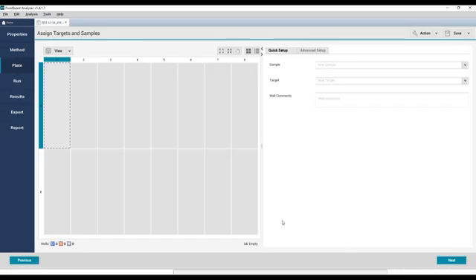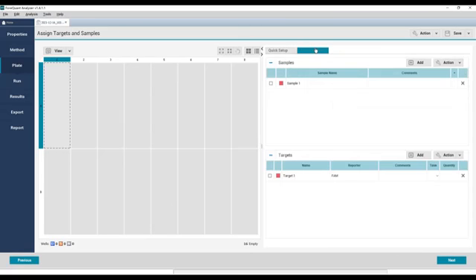The plate setting can be carried out before, during, or after the reaction. In order to save your experiment time, it is recommended to set it after running the reaction. Taking the SARS-CoV-2 nucleic acid detection as an example, we detect the SARS-CoV-2 ORF1ab gene and the N gene using fluorescent probes. The specific settings are as follows.